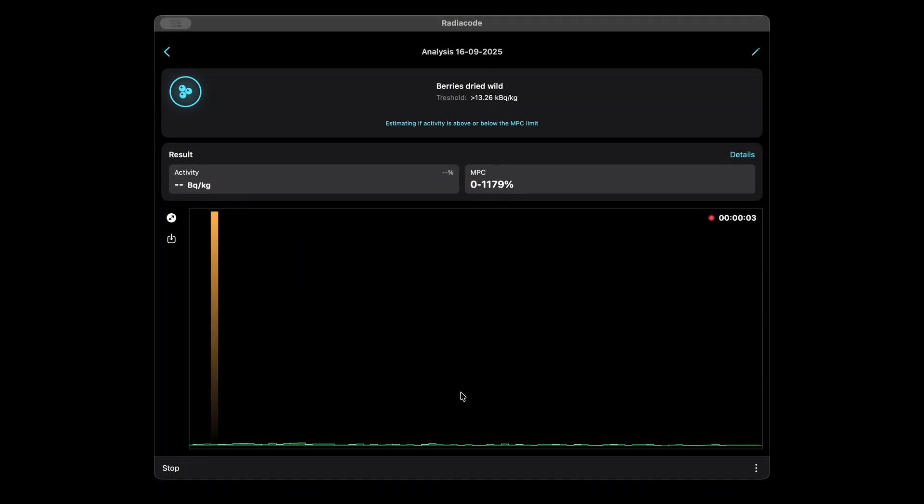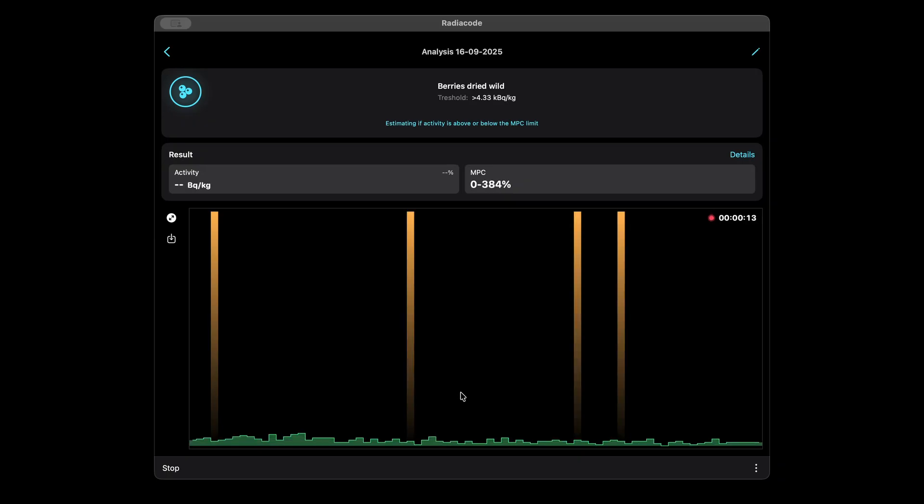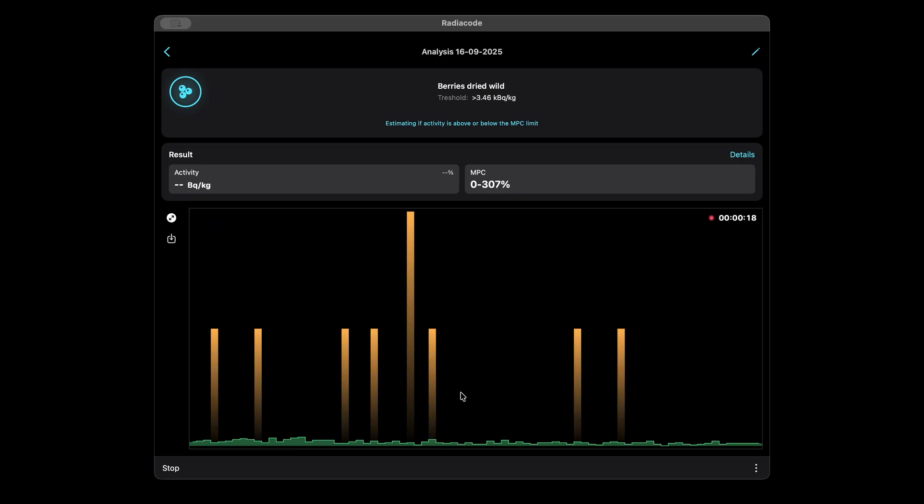Collecting data takes time. If the product is heavily contaminated, results may appear within 30 minutes. For lower contamination, the process may take much longer.